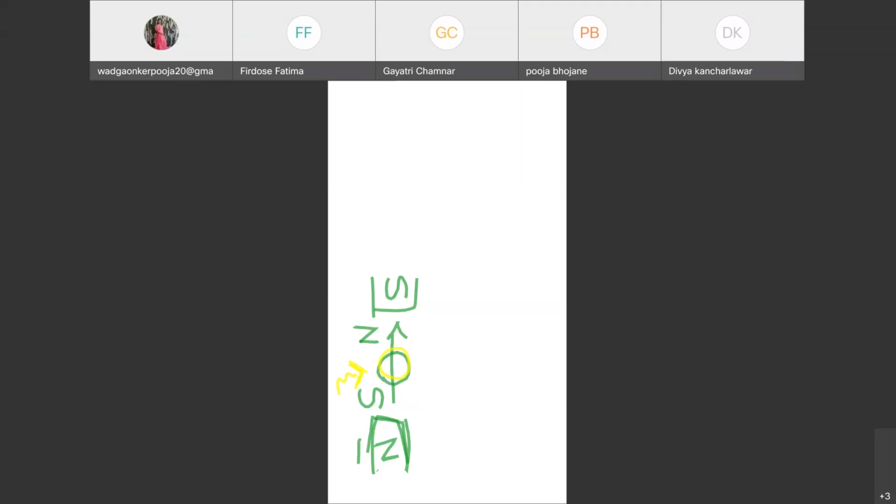वो दो चीजें मतलब क्या, कि एक तो हम हमारा ये अप्लाइड मैग्नेटिक फील्ड, सॉरी लेट मी टेक अनदर पेन. हाँ, एक तो हम हमारे ये मैग्नेटिक फील्ड चेंज कर सकते हैं, या फिर हम हमारी ये रेडियो वेव्स को बढ़ाते हैं. एक तो मैग्नेटिक फील्ड बढ़ाओ मतलब H0 बढ़ाओ, या फिर आपकी रेडियो फ्रीक्वेंसी बढ़ाओ, दैट इज ओमेगा. And both of these are directly proportional to each other. That relation is omega is equal to gamma into B0 or beta, you can say.